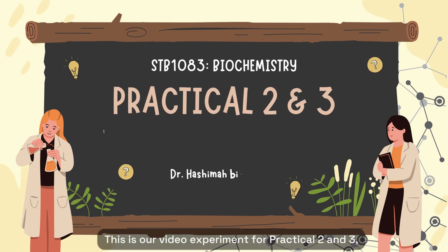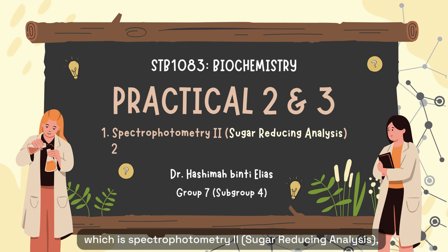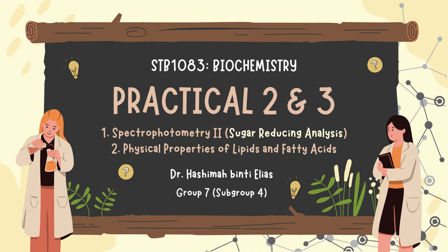This is our video experiment for Practical 2 and 3, which is Spectrophotometry 2, Sugar Reducing Analysis, and Physical Properties of Lipids and Fatty Acids by Group 7, Subgroup 4.